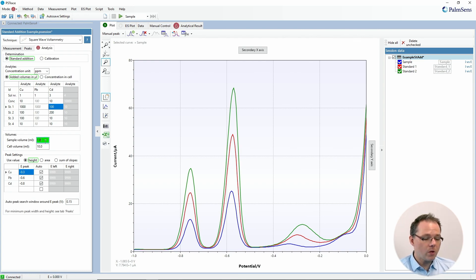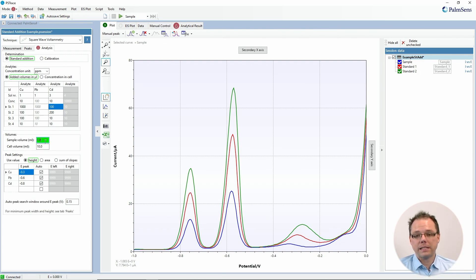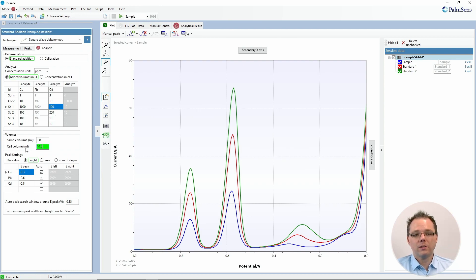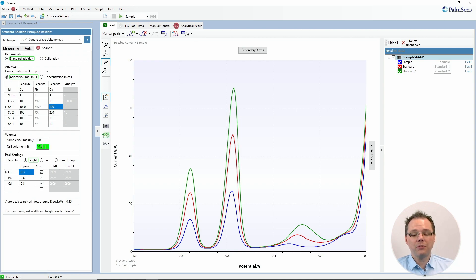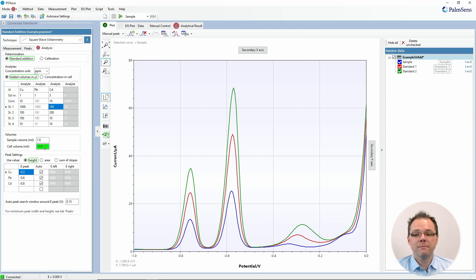Then we have the sample volume, which is the original amount of sample that you put into your electrochemical cell — these are usually then diluted. The result of the dilution is what you put into the cell volume. For example, if you put one milliliter of river water in your electrochemical cell and filled it up with measurement buffer to ten milliliters, you would enter one milliliter and ten milliliters here. If you put completely unmodified river water in the cell, you would write ten milliliters in both fields.